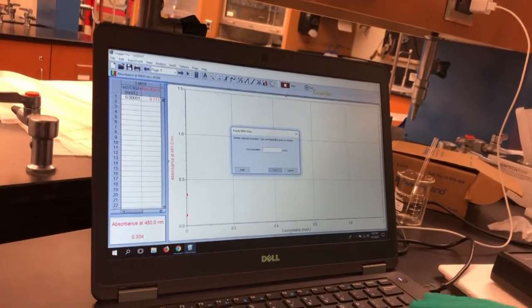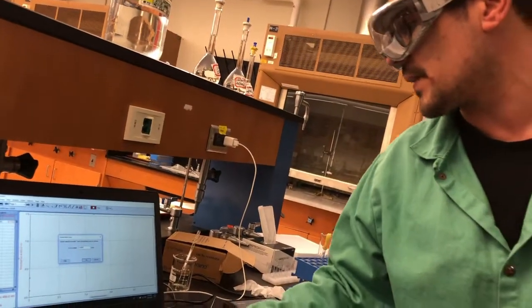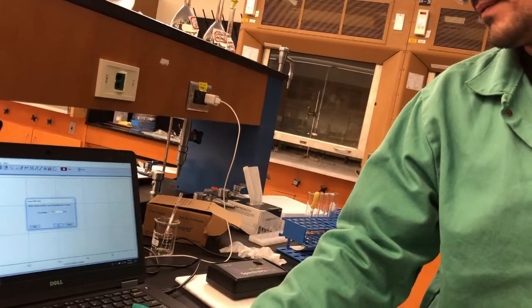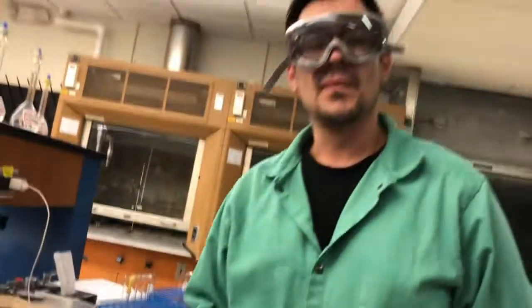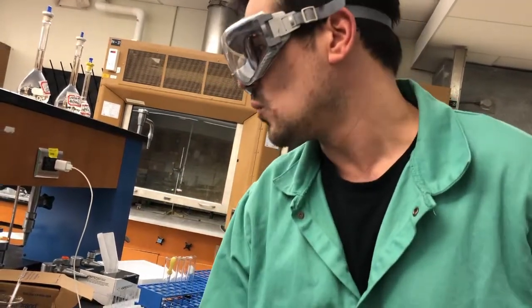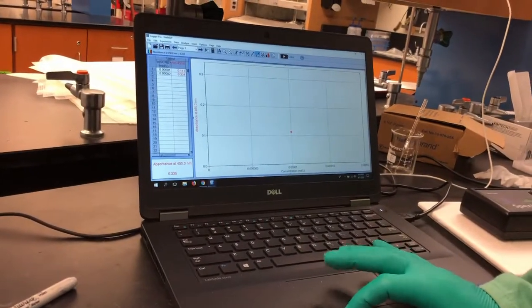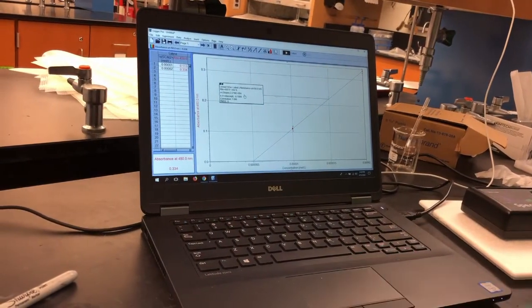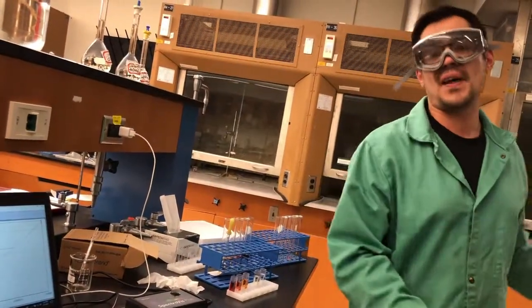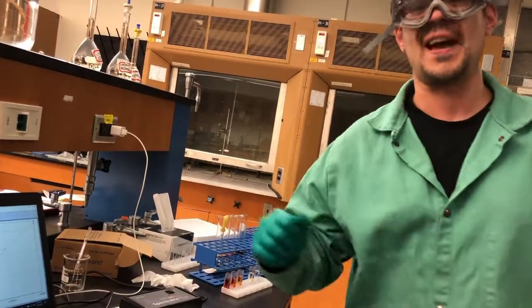And again, we're going to put in our concentration, 0.00002. And that'll keep that there. You're going to keep doing that for the other 3 solutions. When you're finished, we'll stop the collection and go over here to do a linear fit. Now, once I put more plots on here, we'll get a better fit. But we're going to move on to the next portion of this, which is where you're going to be calculating the equilibrium constant for this reaction.